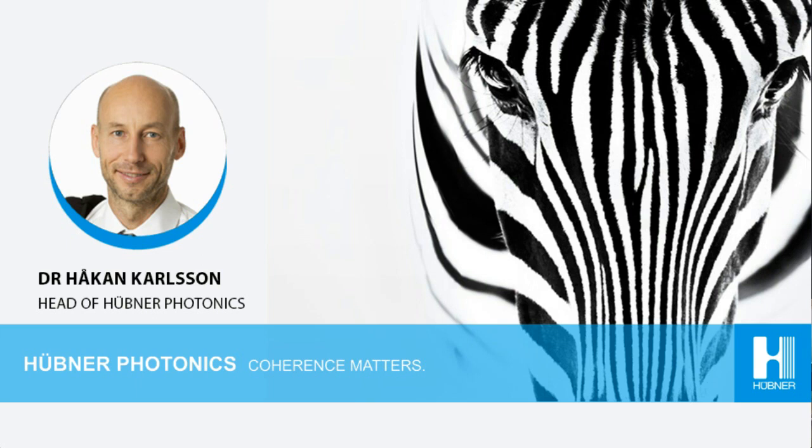But if the illumination laser is highly polarized, it can give additional information about the material, especially for materials that are anisotropic in a way. For instance, crystals or polymers or even certain biomolecules can have an anisotropic response in the vibrational mode.